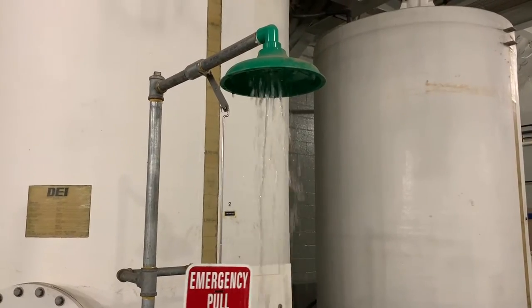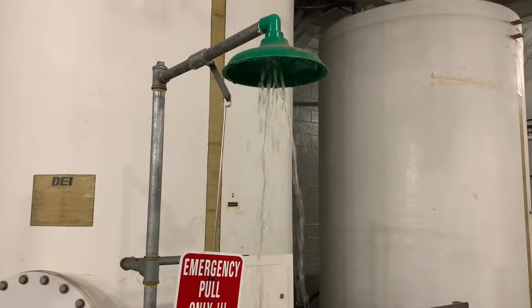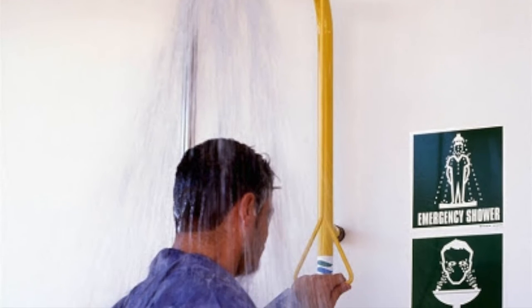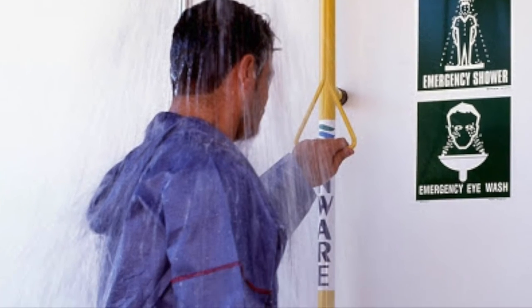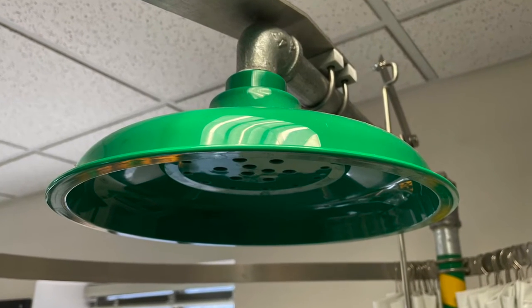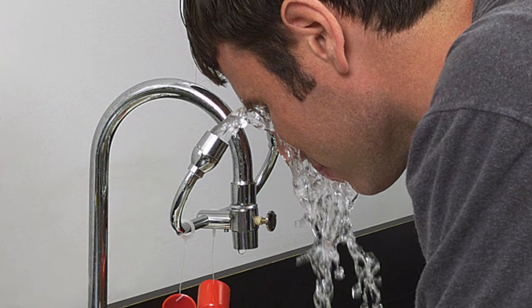Shower stations should provide 20 gallons per minute and eyewash stations 0.4 gallons per minute for at least 15 minutes. The shower's flow should be 20 inches wide at 60 inches above the floor, and eyewash flow should allow both eyes to be washed at the same time. Both should operate without hands once they are activated.